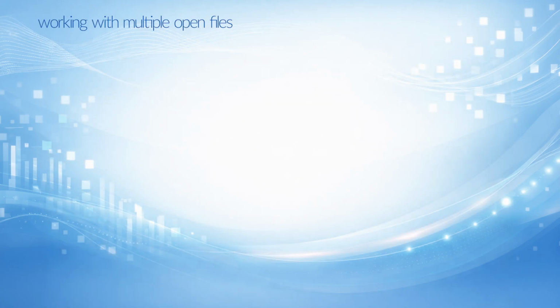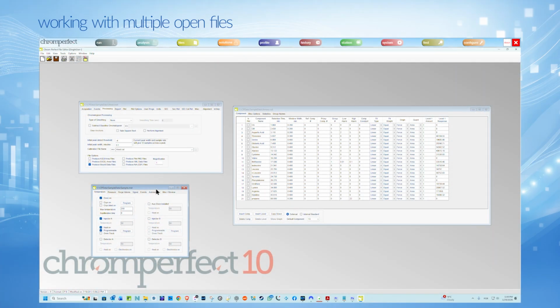Working with multiple open files. Multiple file selections are possible. Each opened file appears in its own editing form. It is possible to open multiple copies of the same file. However, only the first copy is editable. All additional copies are read-only. If changes are made in a read-only form, they cannot be saved unless a new file name is specified.